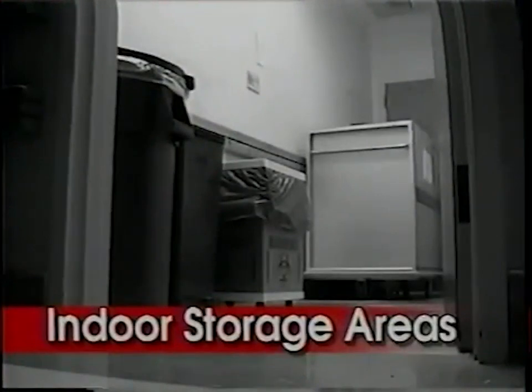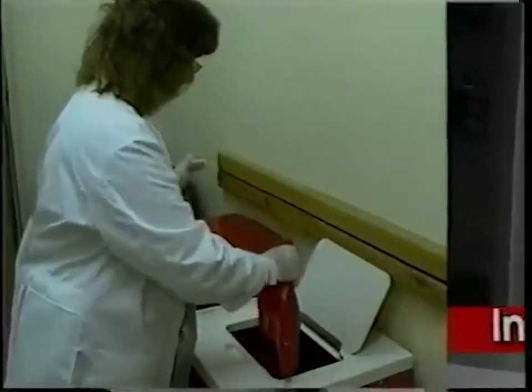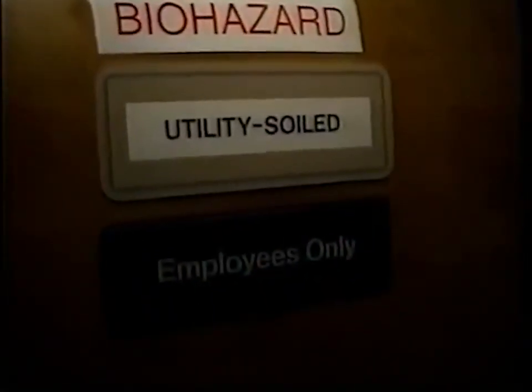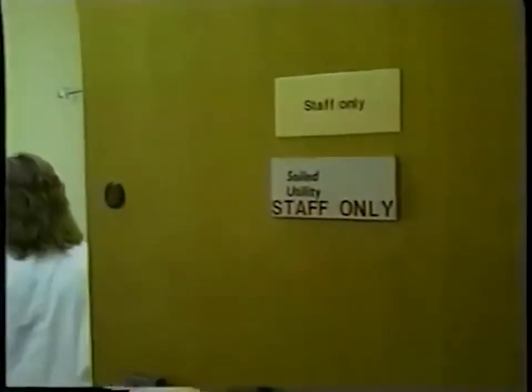All indoor biomedical waste storage areas should be restricted. What does restricted mean? Under the definition of restricted, that can fall under 1, locked at all times, 2, a sign designating the restriction, or 3, just the location itself. The easiest way to satisfy this requirement of the code is to put some sign on the door, whether it be authorized access or employees only, designating the restriction.